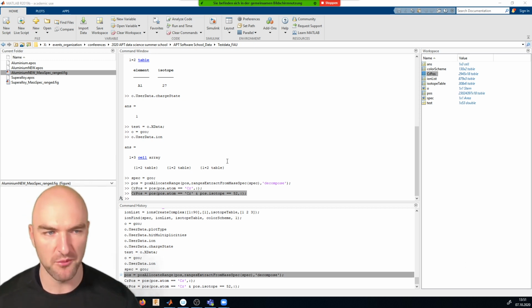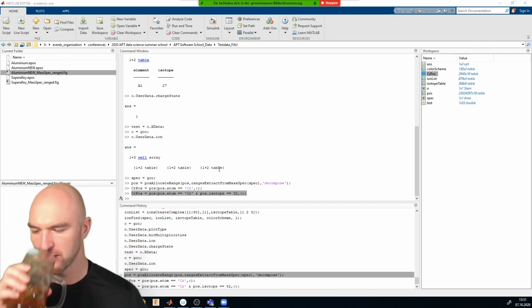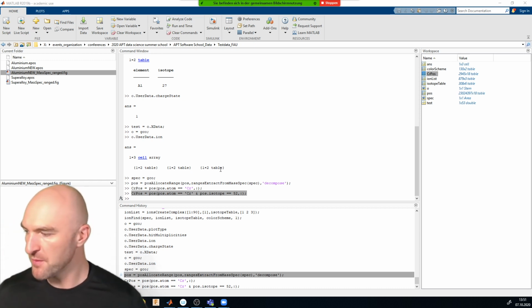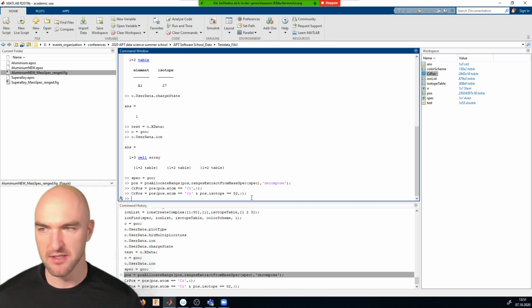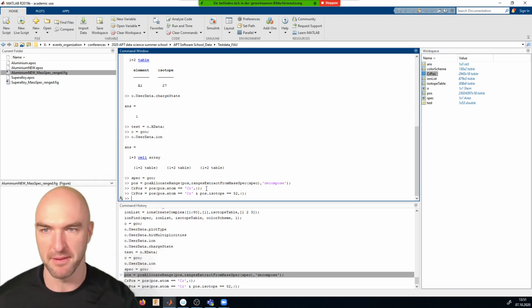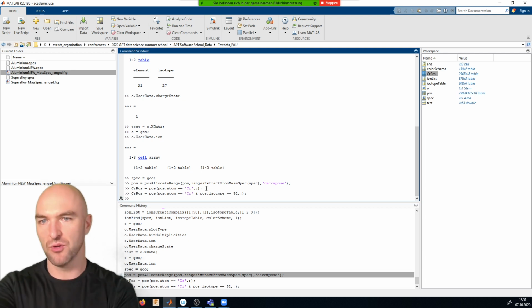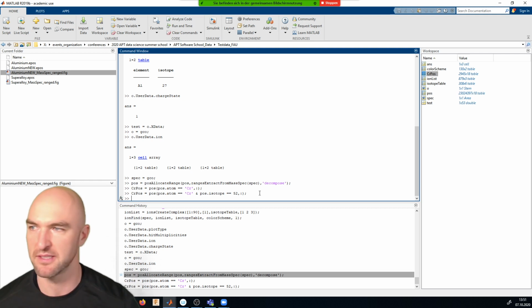And this is really why we like working with tables, because it gives us a very easily visualizable way to interact with the data. So all of the information that you have, you can just use to index into it. For example, if you've got a digitizer-based detector, then you would be able to look at the peak heights or MCP pulse heights and things like that. So any information you have, you can use to filter, to do analysis, and so on and so forth.